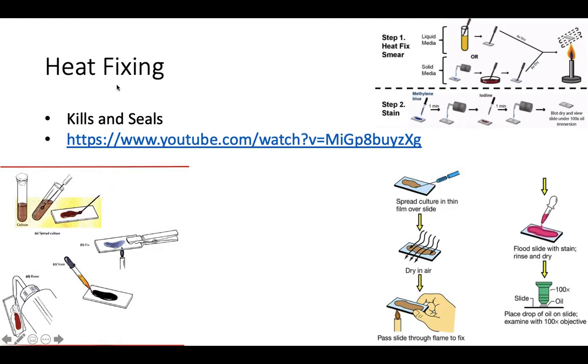So there's other ways to do this, but heat fixing is the most common. So once you've heat fixed the bacteria to the slide, you've killed them, you've permanently stuck them to the slide, you can start adding liquid stains to that smear. And now they won't wash off.